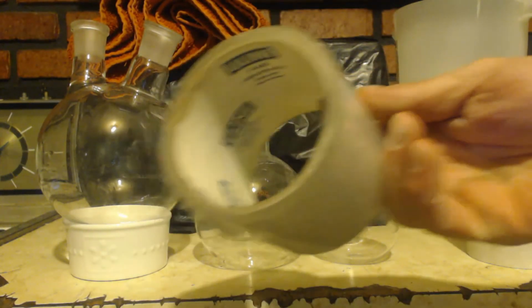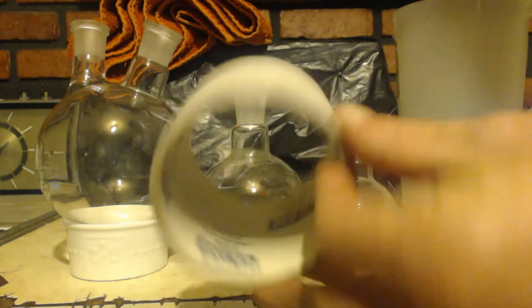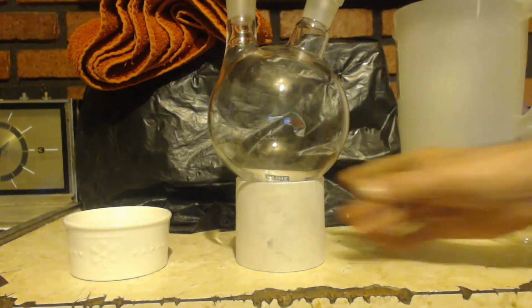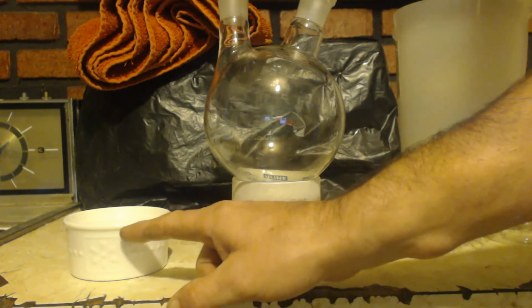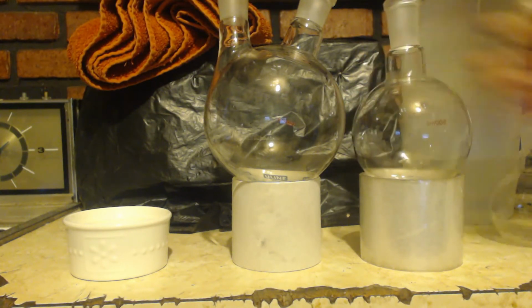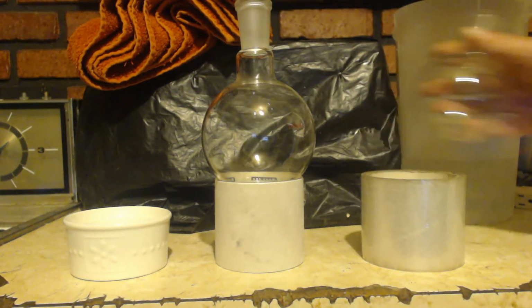See how I got a big roll of tape? You can wait till it gets down, or you can use them just as they are, you know what I mean? But this one's a used one, so I would take it and put it right on there. It's not as apt to slip. There's more friction with this cardboard than there is between glass and porcelain or glass and glass. And even if you have a flat bottom, you can still put them on there. They can fit pretty much all sizes.